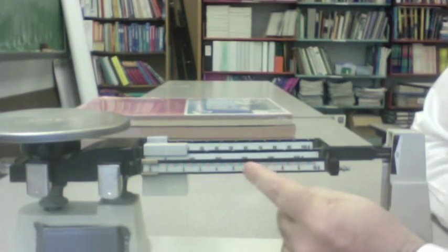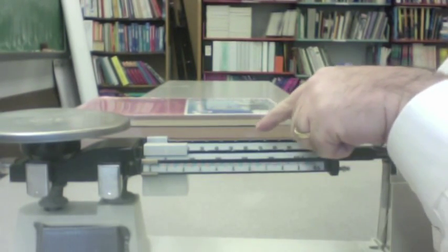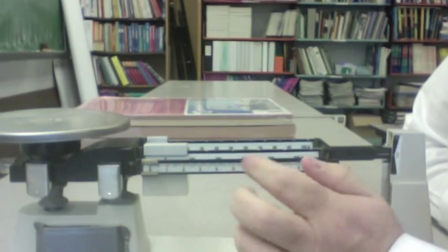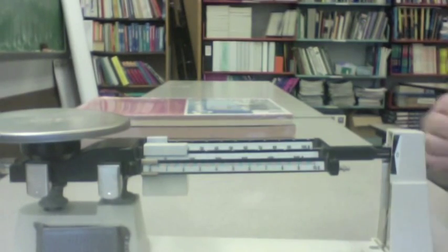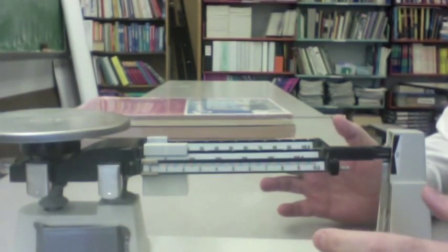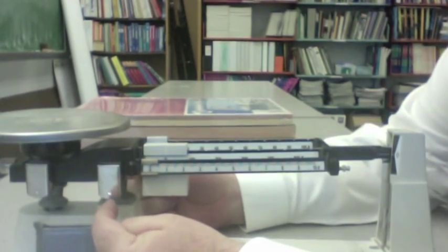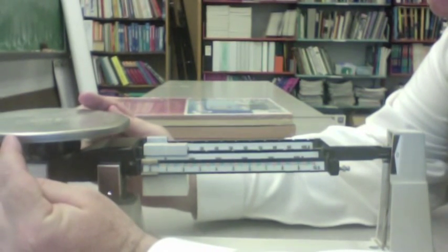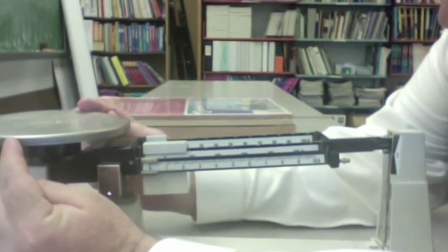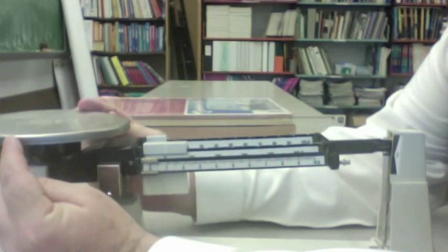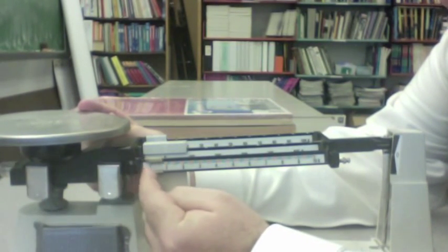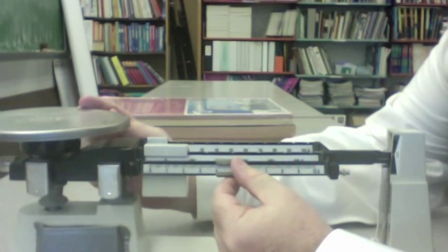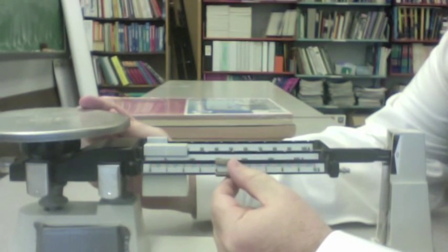It's called a triple beam because there are three beams here in which these riders can slide on. But don't let the appearance fool you. It's really just a fancy teeter-totter. There's a pivot point right here. We put the object we want to measure over here on the pan, which causes the teeter-totter to move. And then by sliding these sliders, we try to balance it out. And that's why we call it a balance.